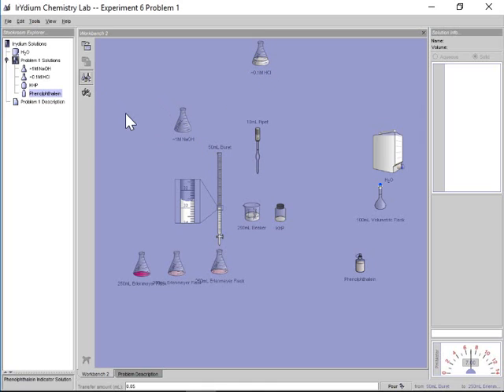At first, you might think about pulling out a grad cylinder. Grad cylinder is very convenient, right? And in the end, I'm going to need a lot of it, so I want to pull out a 50 mL grad cylinder. We did the dilution lesson. Basically, it's a volume ratio. So if I want, let's say, 50 mLs of my diluted sample, I need to dilute 5 into 50. So that's by a factor of 10. Therefore, my concentration would drop from 0.92 to 0.092.